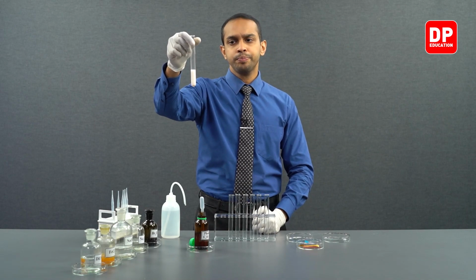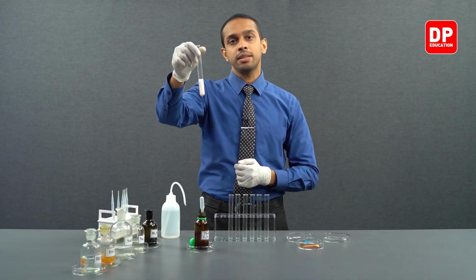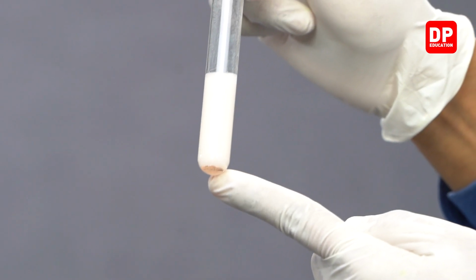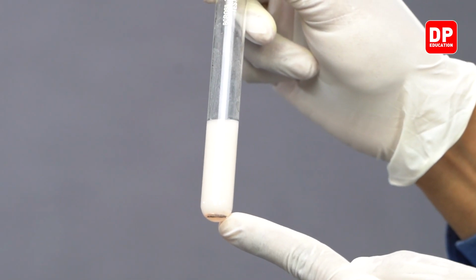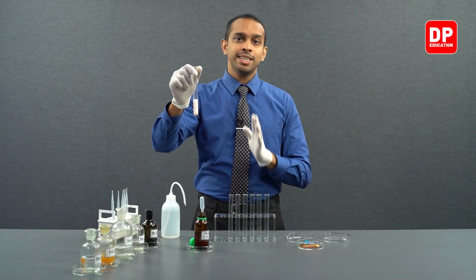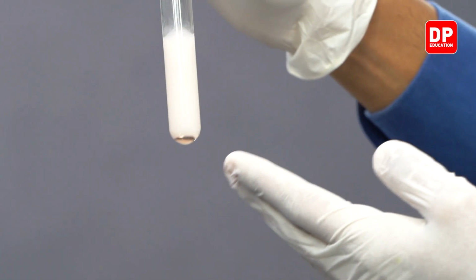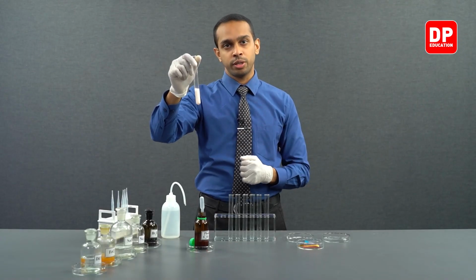As you can see, upon shaking the test tube, most of the phenol did dissolve in water. However, there is still a small portion of phenol that is not dissolved in water. So this indicates that phenol is moderately soluble in water, and it dissolves in water to form a phenol solution.